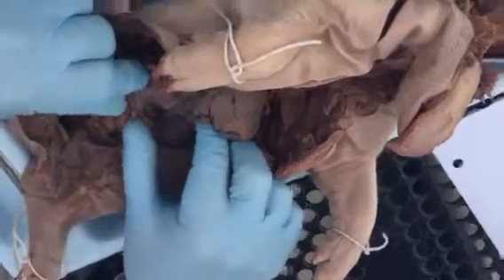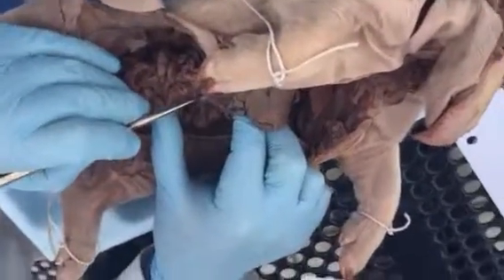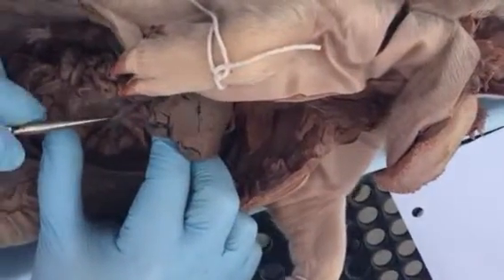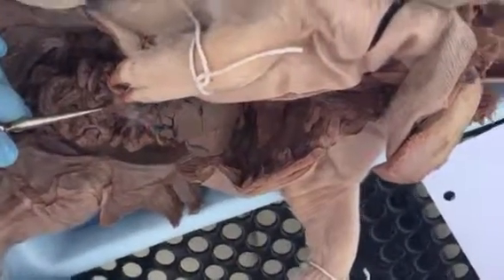And then if you look at the base of the mesentery, see these swellings here? Those are lymph nodes. And again, that's actually a nice set there, but in some pigs they really pop out. Okay, and that's it.